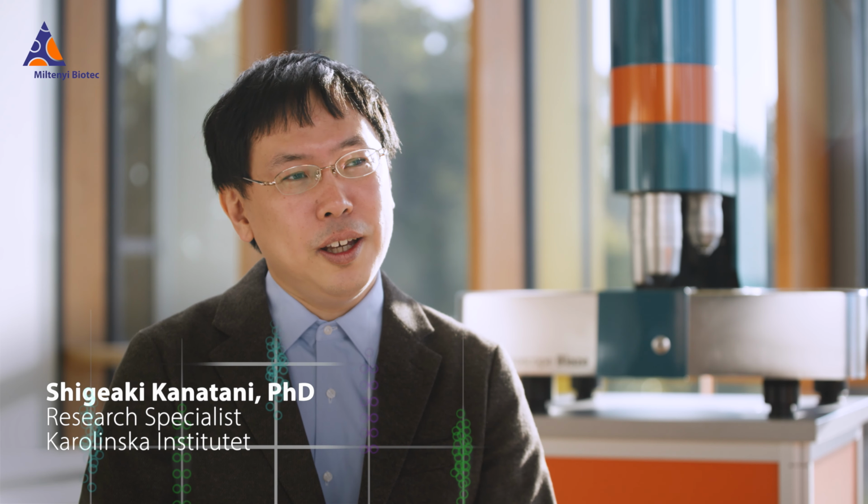To start with, could you briefly tell us a bit about your research focus and the main question that you're trying to address? Yeah, I'm working in the imaging facility in Karolinska Institutet, and I'm helping facility users, and at the same time I'm doing research for method development to accelerate the users' research field in general. But I'm working in an imaging facility, so my focus is developing good 3D imaging methods. That's the current focus.